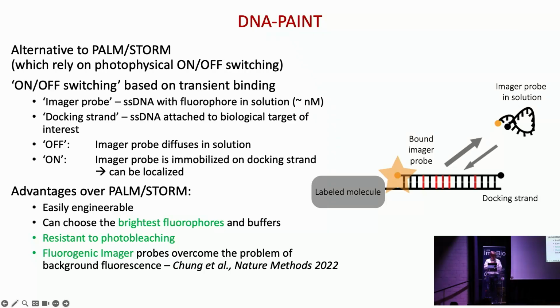In the past, this DNA-PAINT, and that's I think why it took a while to become popular, was not very fast. The blinking was very slow. People imaged at 4 frames a second instead of like 100 frames a second or so, what we do in STORM, and it took hours to get a good image. And the reason for that was the background was too high.